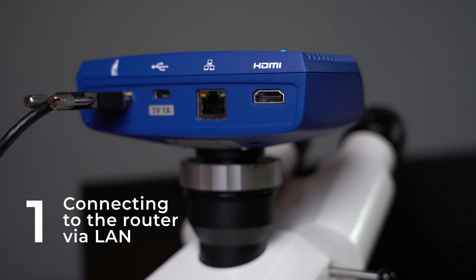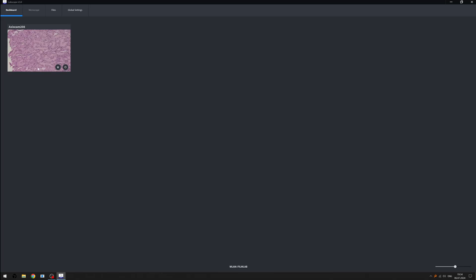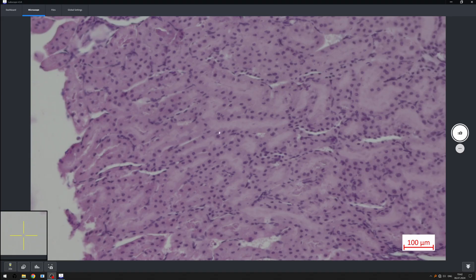Okay, here we have three options. The first and easiest way is to connect the camera to a Wi-Fi router using an Ethernet cable. The camera automatically appears in Labscope software if your computer or other devices are connected to the same Wi-Fi access point.